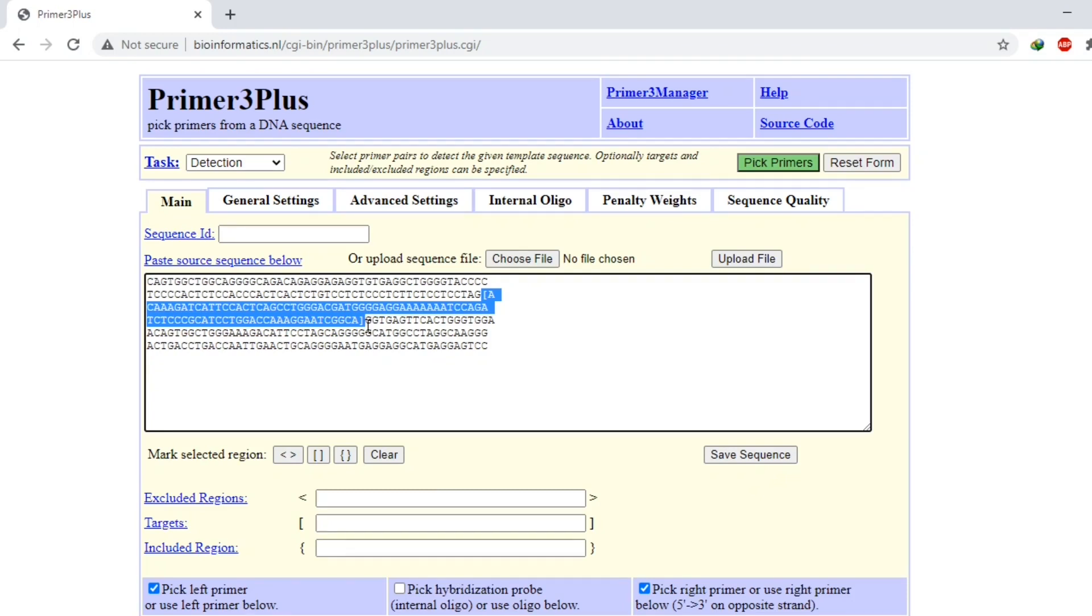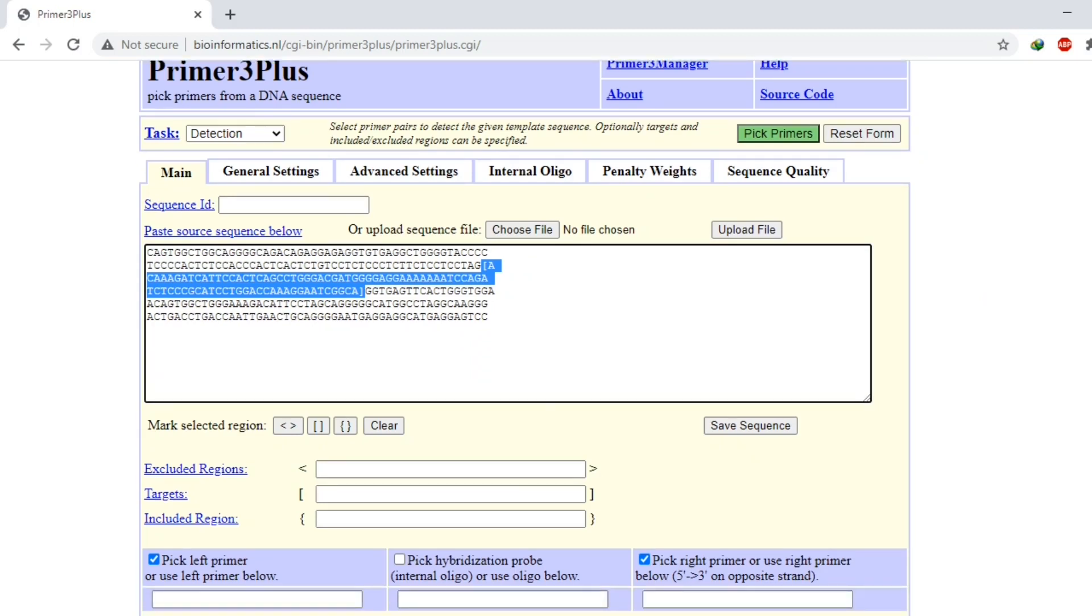So this is my target region and I want to design primers outside this region. So this was a simple trick. You just click on this 'Pick Primers' to design primers.